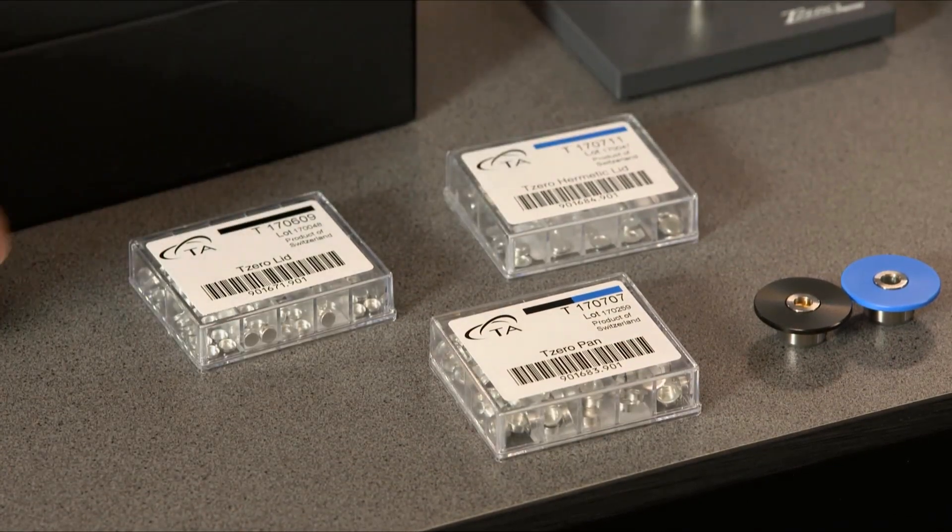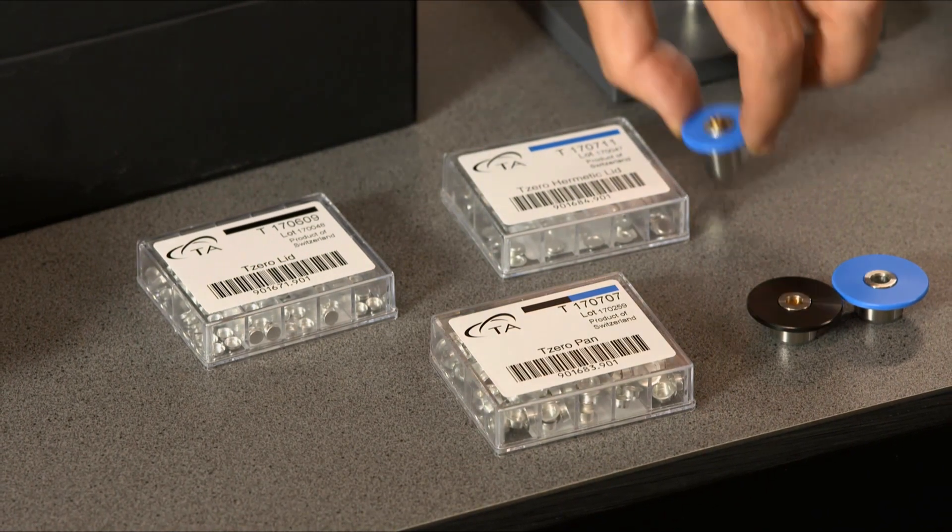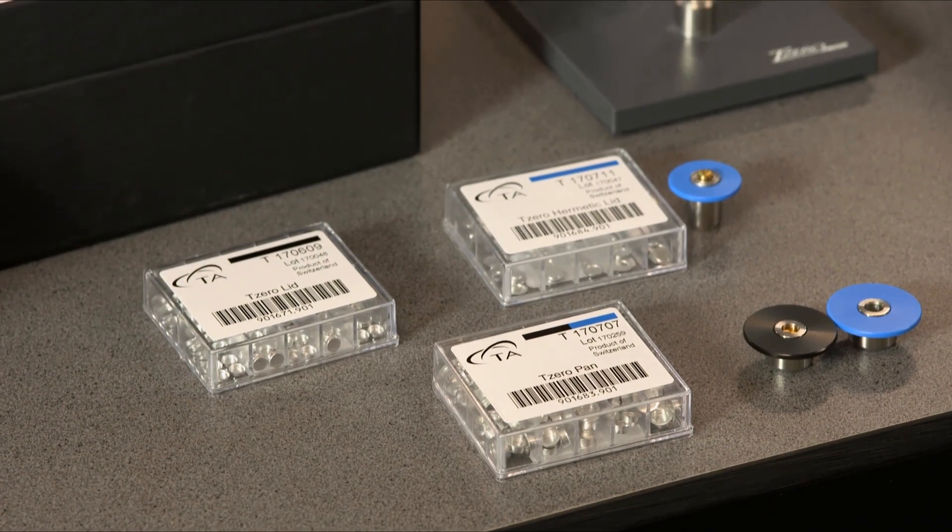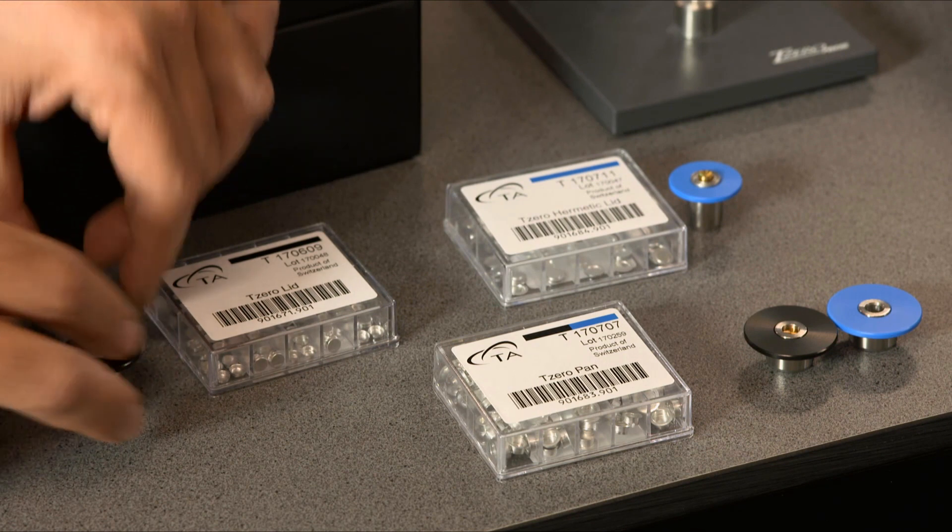And then you have two lids, one which we call T0 hermetic lids, which will be used with blue upper die. And this one is T0 lid, which will be used with any of those.